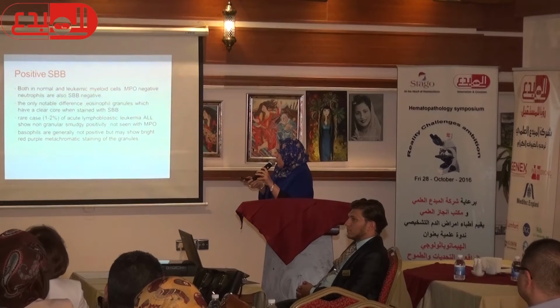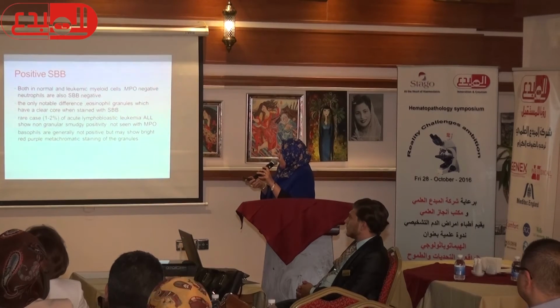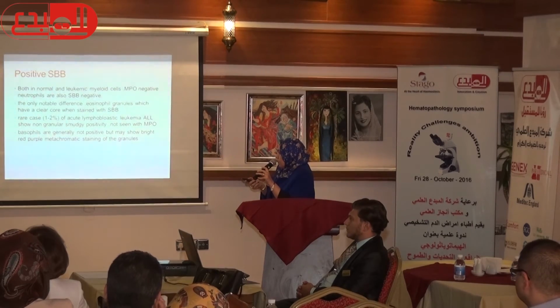In rare cases, 1 to 2% of acute lymphoblastic leukemia (ALL) show non-granular Sudan Black positivity not seen with MPO.